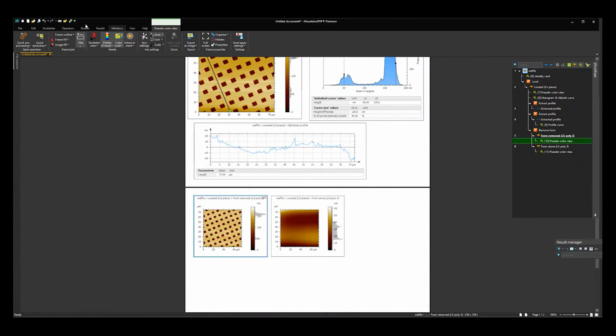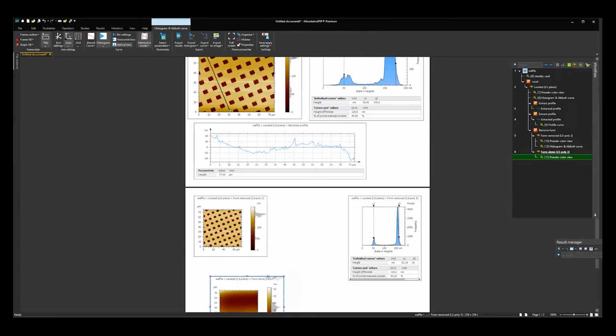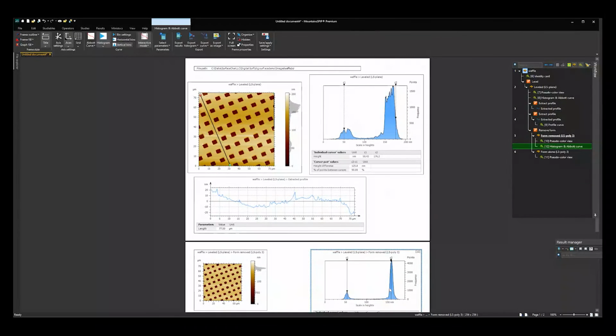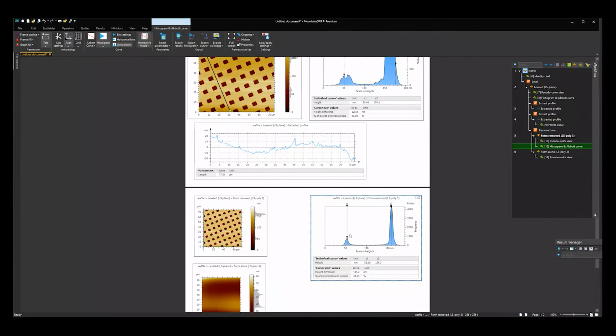And let's just do another histogram now on this plane fit image. So I'm going to call up the study histogram, and let's move this here below. Now we can compare this histogram to the histogram above here. Much cleaner, much better. And then you can even measure the distance between these 2 points. That's a great average calculation on your entire grid in terms of the difference between the pits of the matrix.